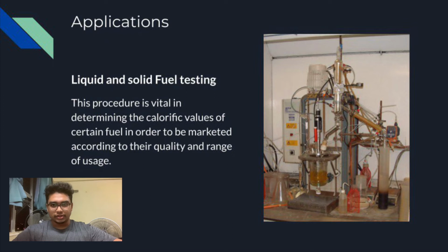One of the uses of the oxygen bomb calorimeter is the procedure of liquid and solid fuel testing. In this procedure, it is used to determine the calorific value of a certain fuel in order to be marketed according to its quality and range of usage.